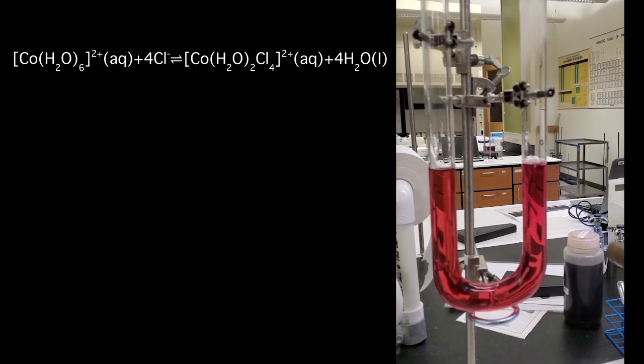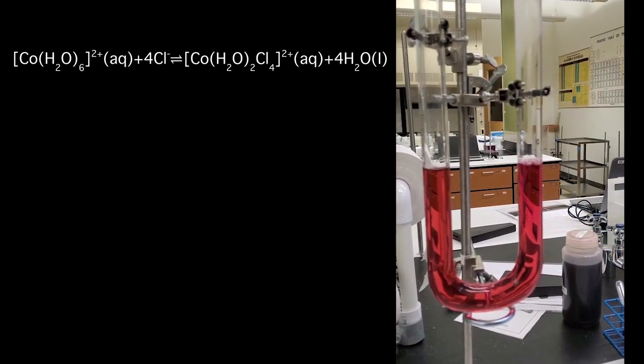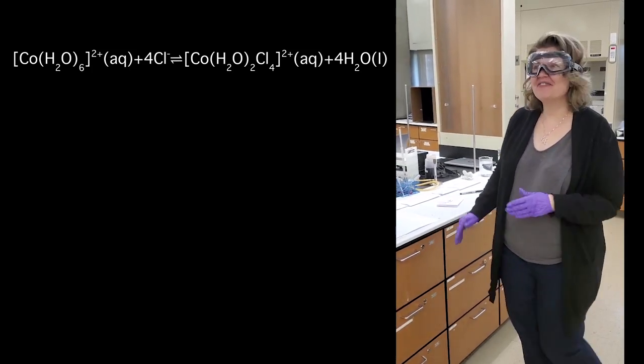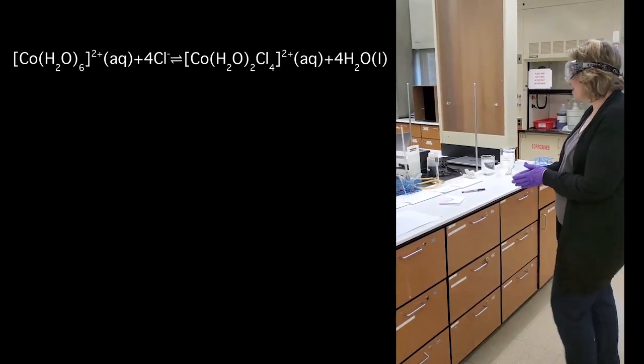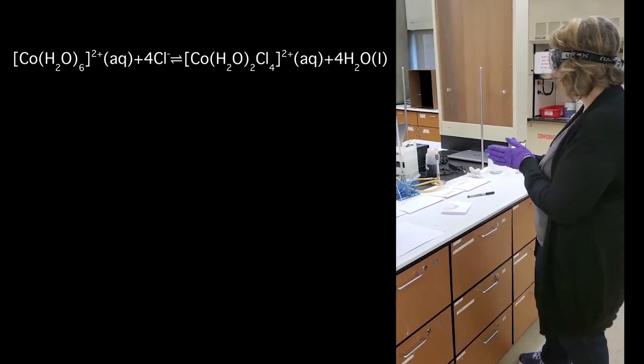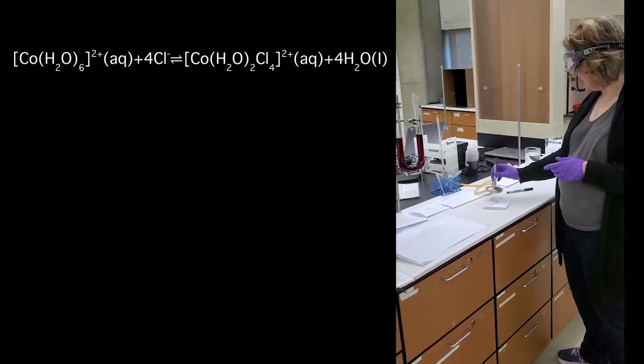I'm starting to see a little bit, but I think I'm too dilute to get this to work — it's too dilute a solution. So let's pause and restart. We are going to look at the effect of temperature on our system. We tried the hot water bath and it just wasn't very impressive, so we're going to amp it up and go straight with direct heat.